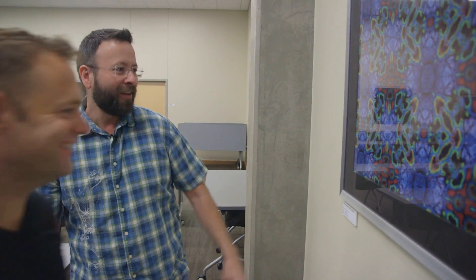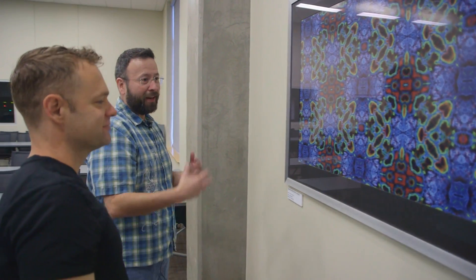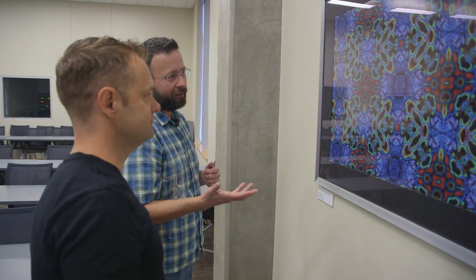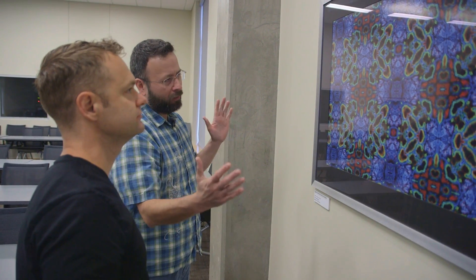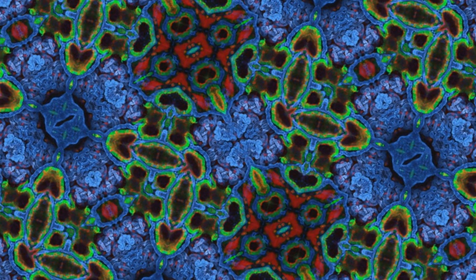When I do this, I go through a lot of iterations and try to pick the one that brings out a couple of different features. For example, this looks to me a little bit like a frog — you have these eyeballs, and it looks like maybe a smile, his mouth right here. I'm always looking for things like that. When I finally create an image, I try to see how many different visually striking features I can get into one.